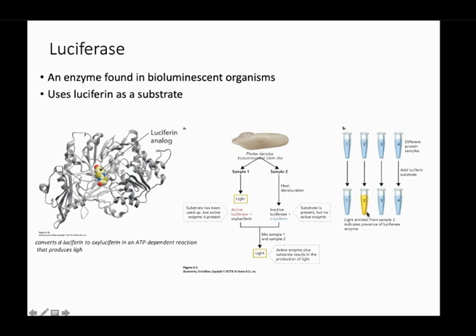It's easy to look for the protein of this specific enzyme because we know it emits light. So if I lyse the organism and collect all the tubes, you will have a bunch of tubes. You're not going to be able to see it, but perhaps you will be able to, because it's luciferase, read the luciferase itself. From all these tubes, we're saying that number 2 is where your enzyme is. The point here is that you should know the protein that you're studying, because in this case you will say, well, I'm looking for luciferase. I know it emits light, therefore there is a method to look at the light, right? If you don't know anything, that will be a little bit complicated.